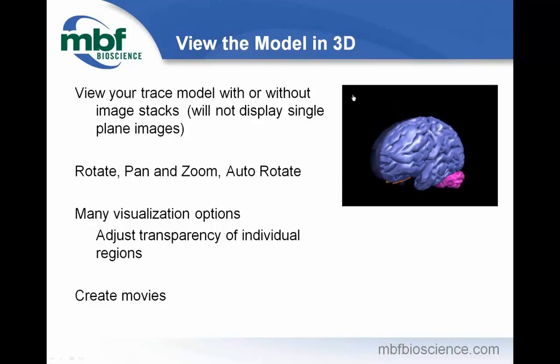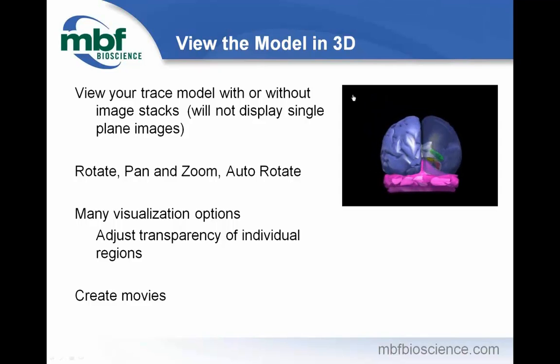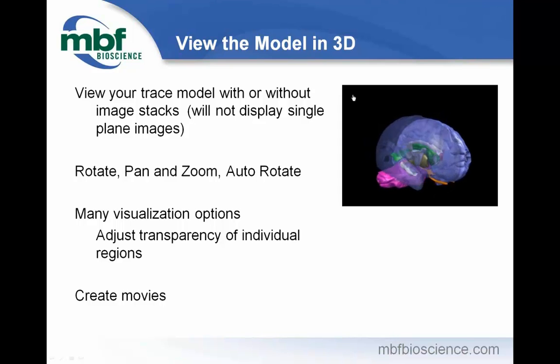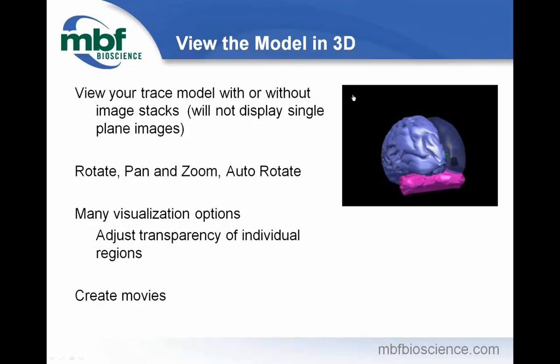There's actually too much to even discuss today, and because of that, we have decided to do another webinar specifically on 3D visualization and preparing images for publication. So that'll be a little bit later in the year. Looking forward to that one.